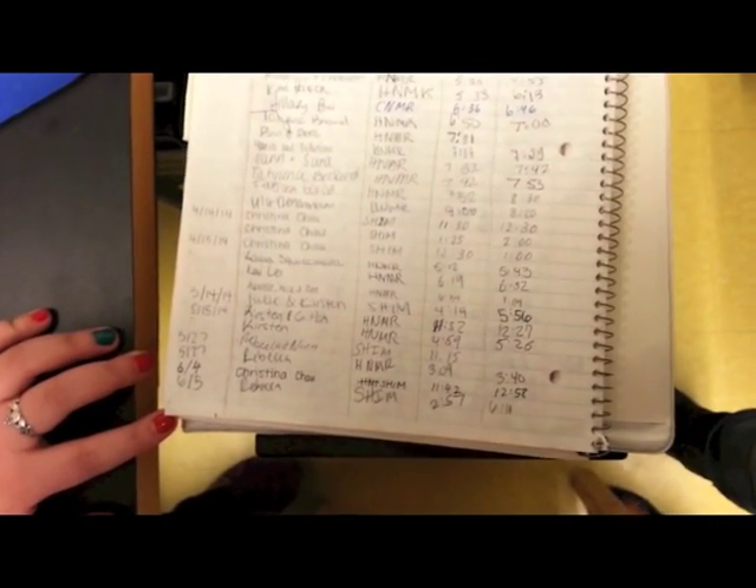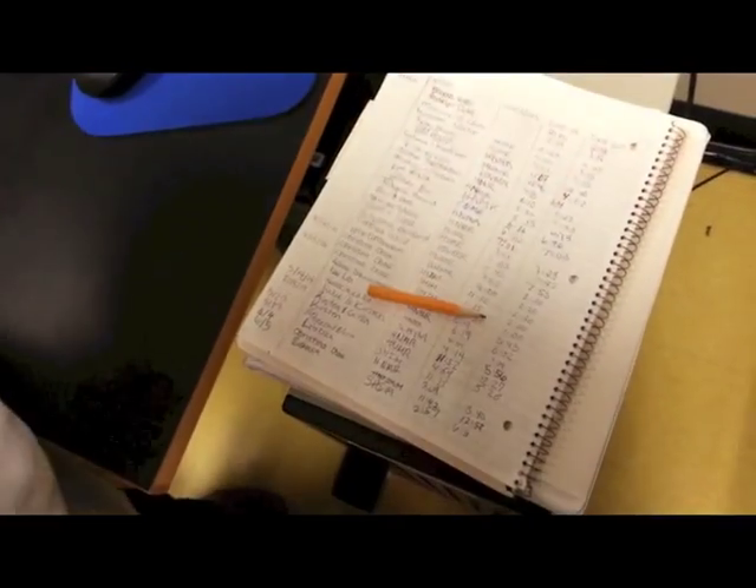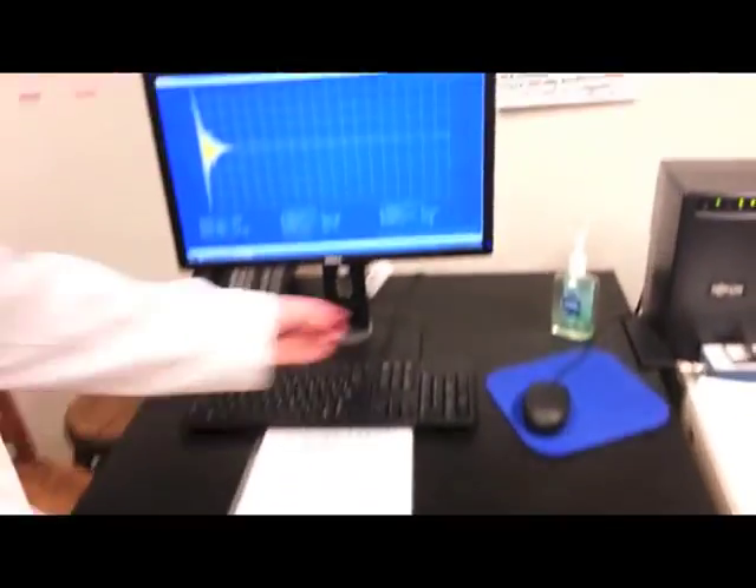Once you're done shimming, come back over to the sign-in sheet and sign out with the time that you are done. If you're the last person to use the machine for the day, come over to the plug for the pump and unplug it. On the computer, turn the monitor off — not the actual computer itself. And that's it.